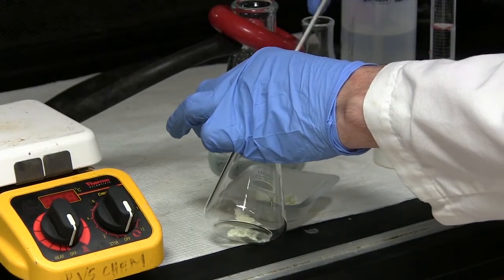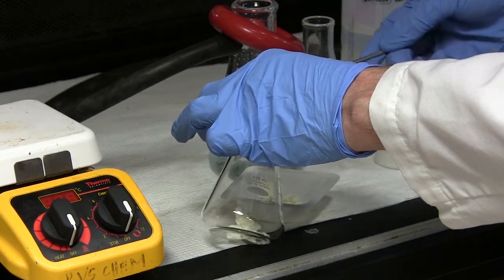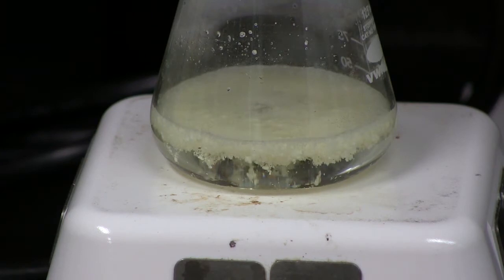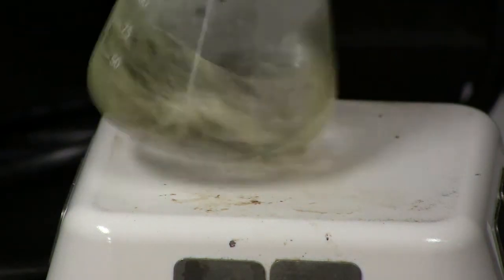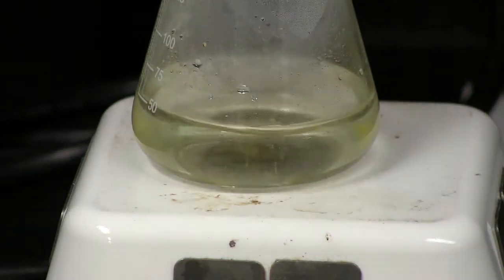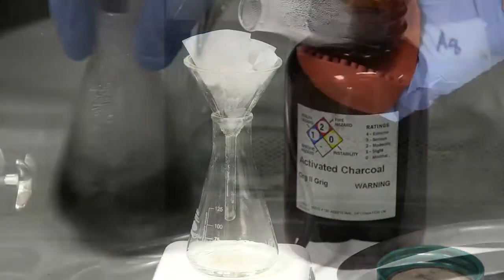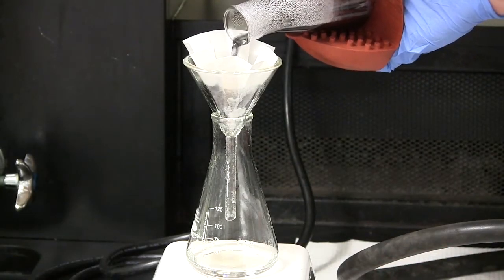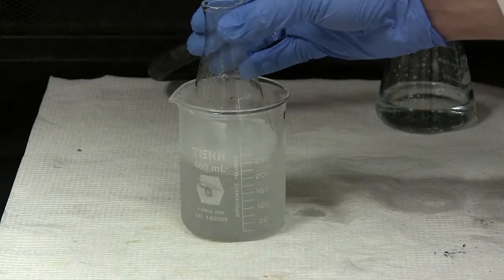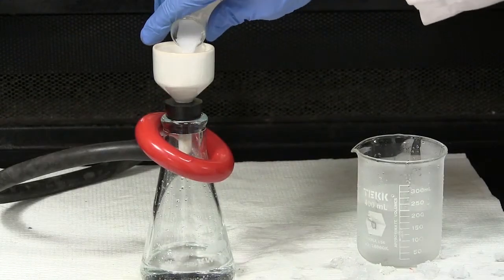Begin recrystallization by transferring the crystals to a 125 milliliter Erlenmeyer flask. Add 30 milliliters of water and heat to boiling on a hot plate. Some samples will have a brown, oily substance that will not dissolve. Set the sample off the hot plate, add a small scoop of activated charcoal, and heat to boiling again. Perform a hot gravity filtration of the sample to remove the charcoal. Let the sample cool to room temperature, then place in an ice bath for 10 minutes. Vacuum filter the sample. Label and store the benzoic acid.